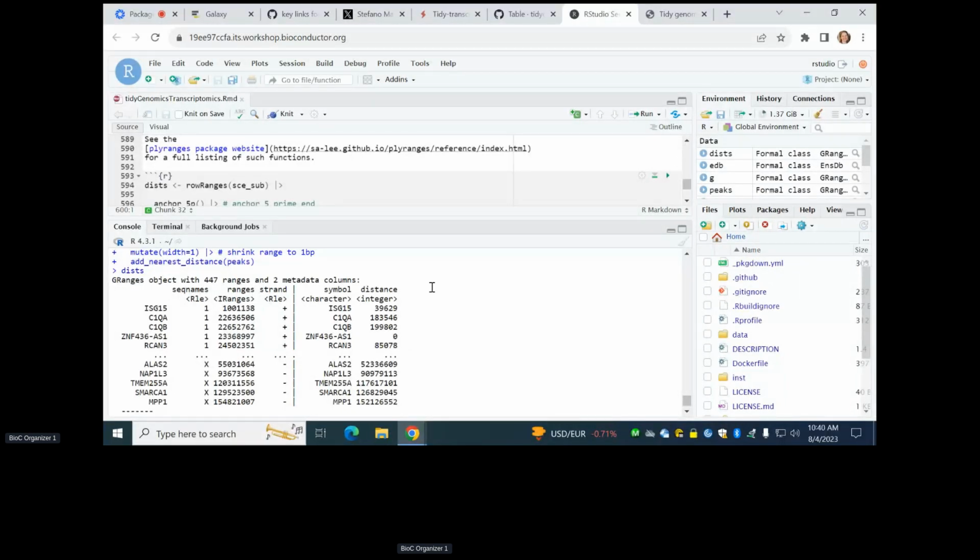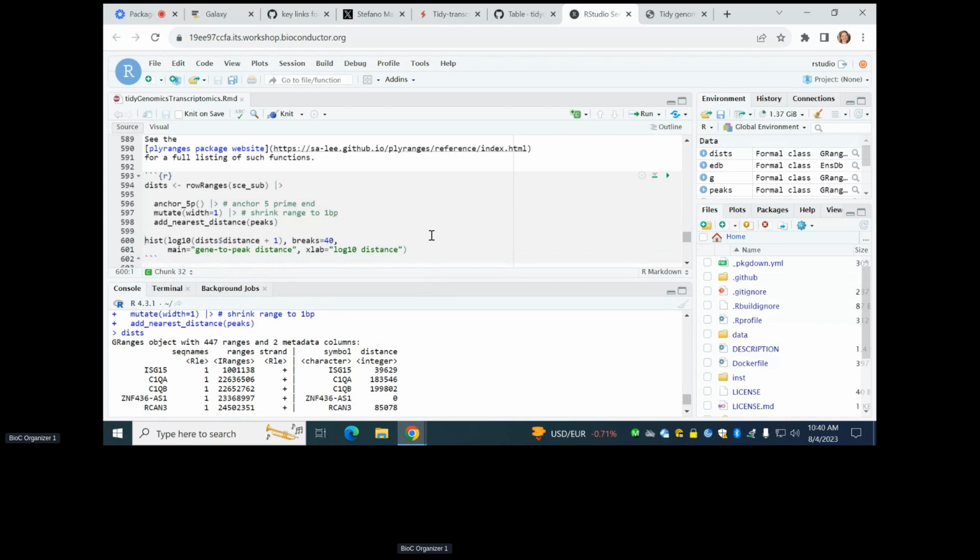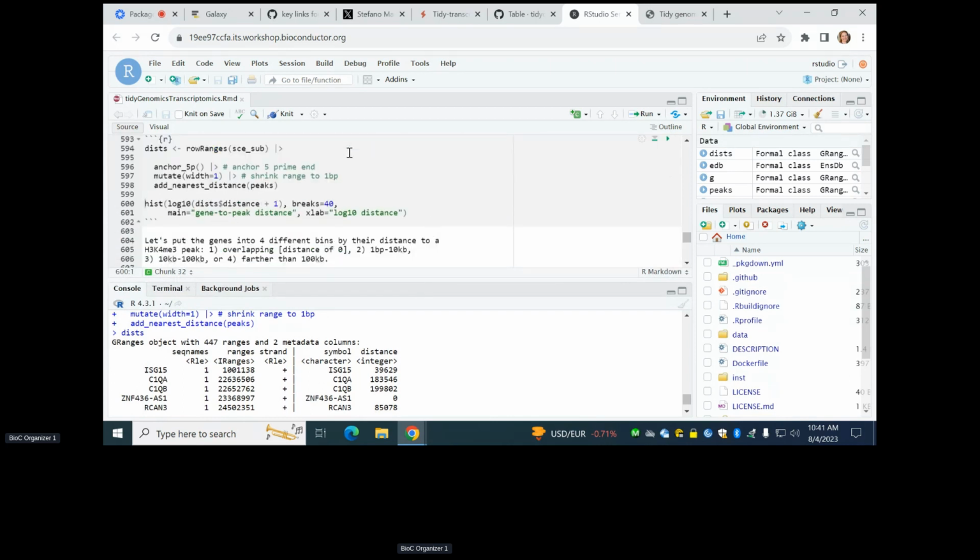I have a question. When you apply the ranges to the genes, did you get each transcript's ranges, or the total gene ranges, or the main ranges? Like the second part of the question, would you use this syntax to do the same just for transcript information? Yes. You could do all of this at the transcript level, and it's like you planted that question. I'm going to talk about exactly your first question in a lightning talk, hopefully today. Typically in Bioconductor, if you ask for genes, it's the full extent of the gene, but you can do something better. I'll defer that till later today.